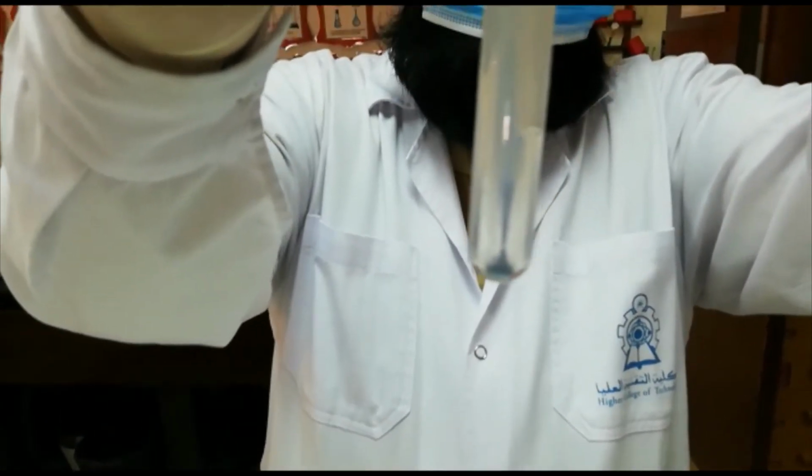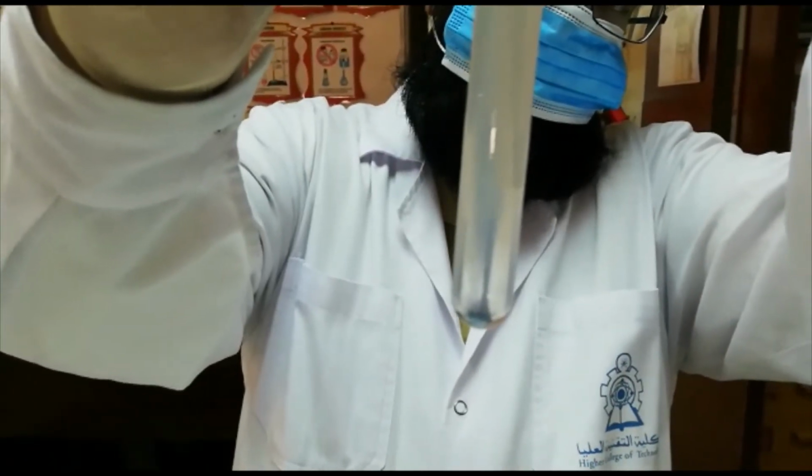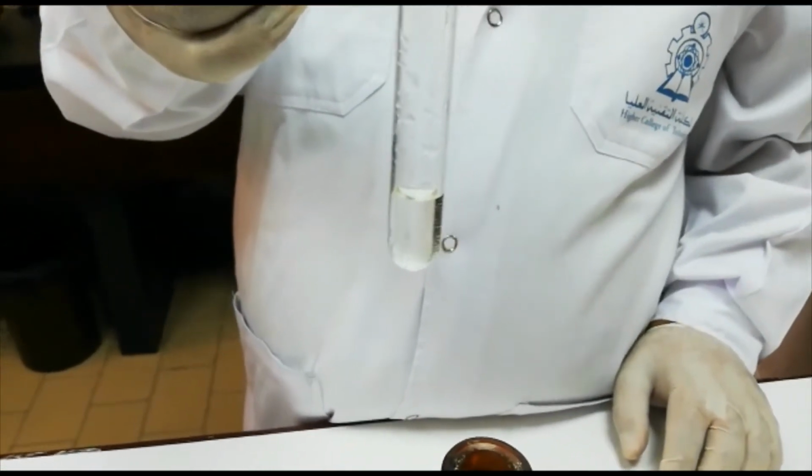So you can see that it is becoming milky. It was a clear solution before, but now after passing carbon dioxide through lime water, it is becoming milky, like milk color. This is the salt of nitrite, potassium nitrite.